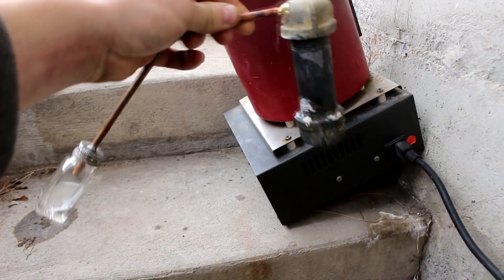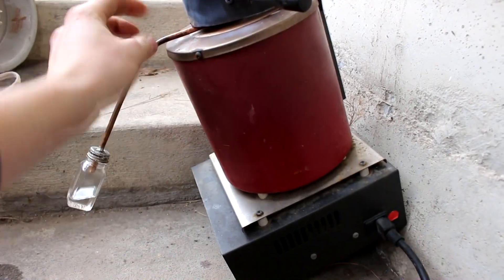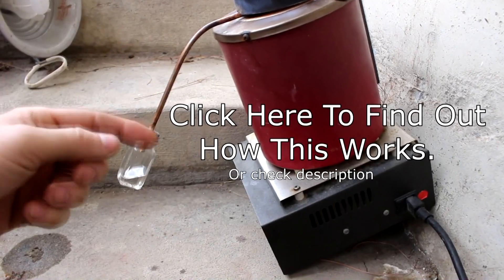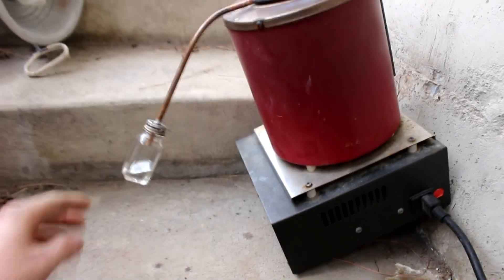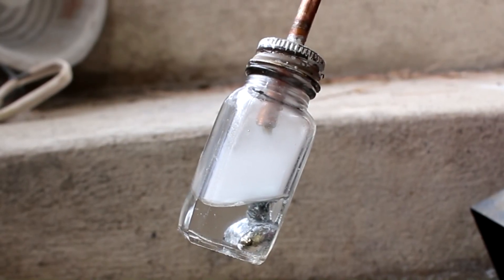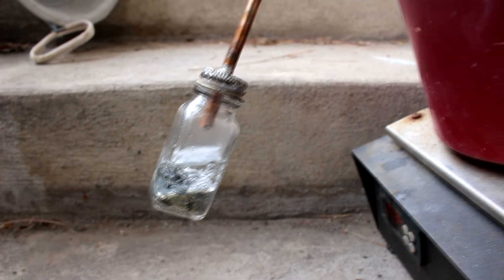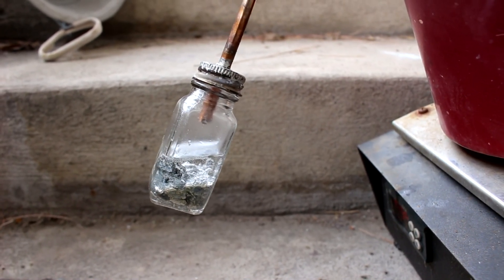As you can see, I've scaled back the size of the distillation apparatus and I'm using a more constant heat source. I'll have to run this several times, but I know this setup will work because I've done this before — I have another video where I made cesium at home. Let's let this run and see if it works; if it does, I'll just do it six more times. There we go — that's the way to distill cesium. Looks like the distillation's about done, and that's a pretty sizable chunk of cesium, but still not as much as I want.